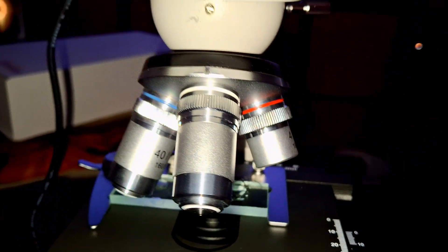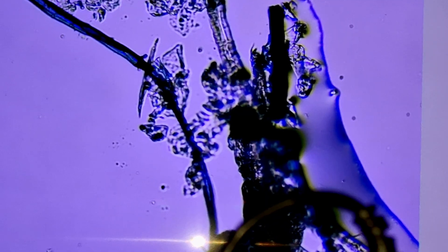Sample extracted. Into the scope it goes, the world beneath begins to reveal itself on the big screen.